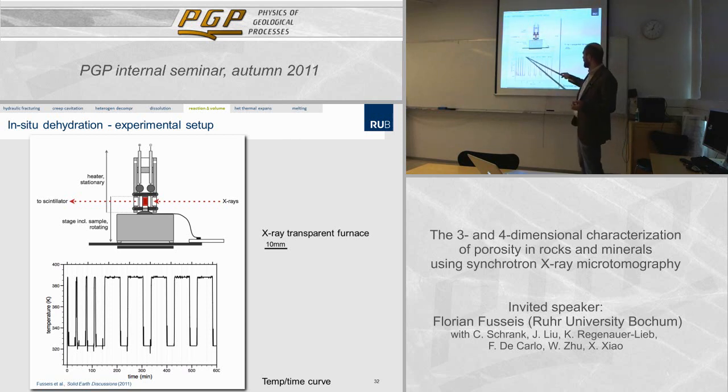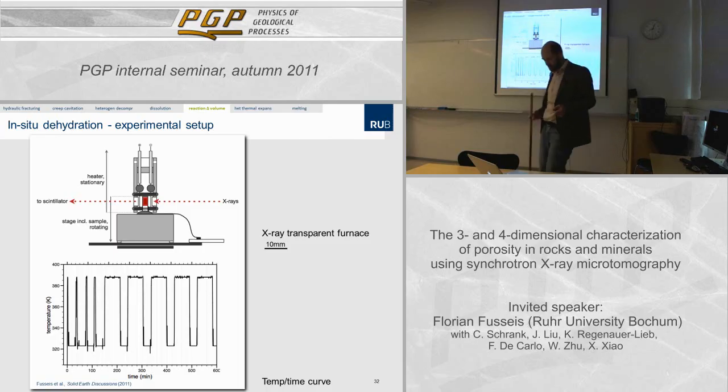So every hour here, we had to shock freeze the sample to 50 degrees Celsius, acquire a scan, heat it very rapidly again, have it running for another hour, and so on.